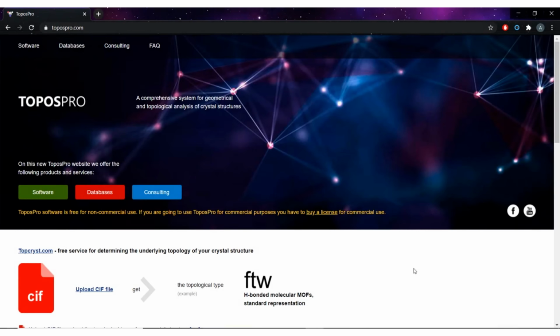This video is the first in a series showing you how to use the software ToposPro. In the partnership between CrystoGen and ToposPro, we have bundled a light version of the software that you get access to when you download CrystoGen. This is the home page for ToposPro.